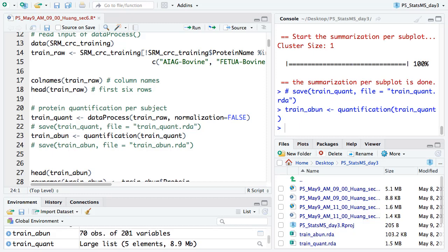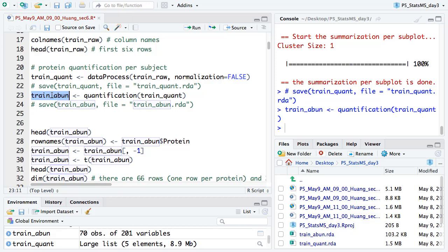For classification or PCA, what we need is exactly a protein abundance matrix — where the columns are different proteins or genes, and the rows are different patients or samples. There is another function in MSStats called quantification. It will give you exactly the protein abundance matrix, so you can output it to do all other analyses.